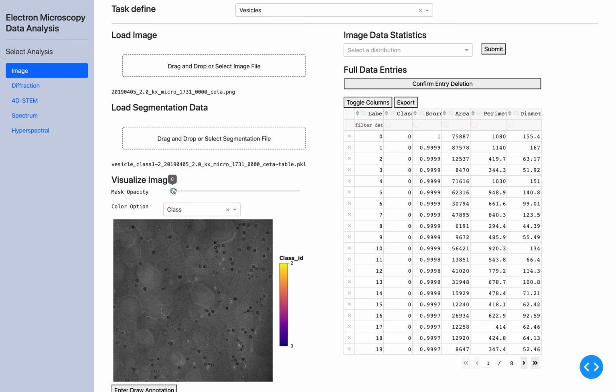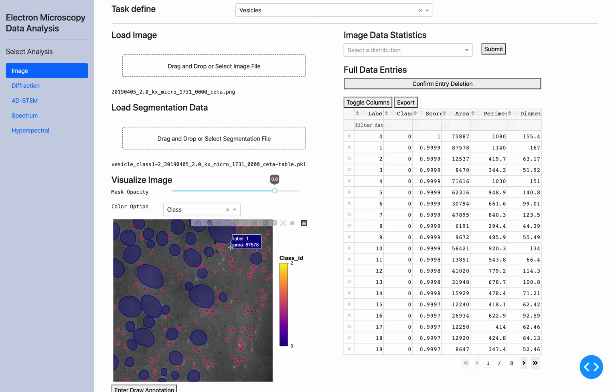In this image, there are three main microstructure features of interest: the transparent large bubbles, which are large biological vesicles, the small black circles, which are small vesicles, and the white small circles, which are holes left by the small vesicles. In the phase 1 project, we succeeded in predicting the large and small vesicles, which can be seen from this mask. And we can also tune the color scheme of these masks.